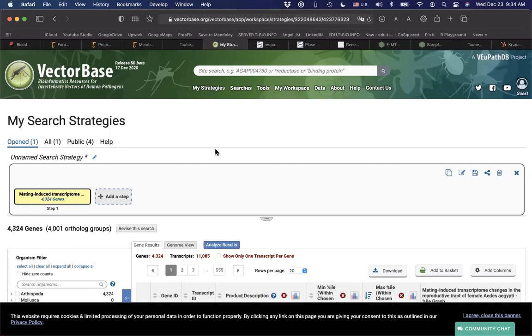So yeah, you're correct. This is more useful for downstream analysis after we already have all the pipelines done up to the read count table. And then we go to this platform.